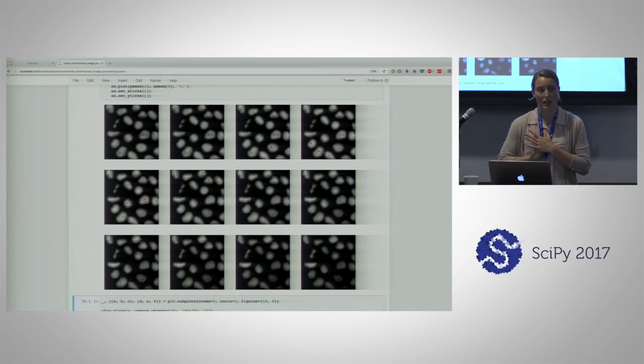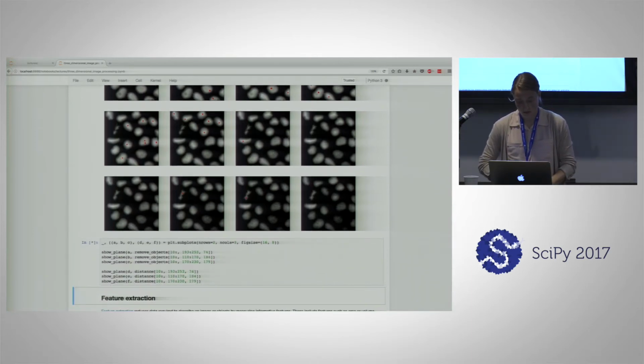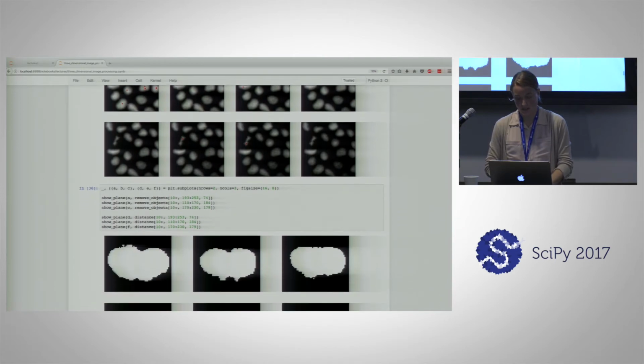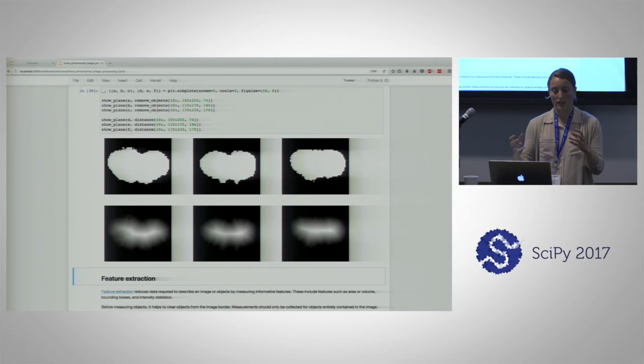And to me, that indicated that, well, maybe instead of the pinch point being on the plane this way, the pinch point was happening in another view. So I zoomed in on those cells in different planes, and indeed, we do see an irregularity to them, a sort of lumpiness. Below are their distance maps, and you can see how it might find two peaks.